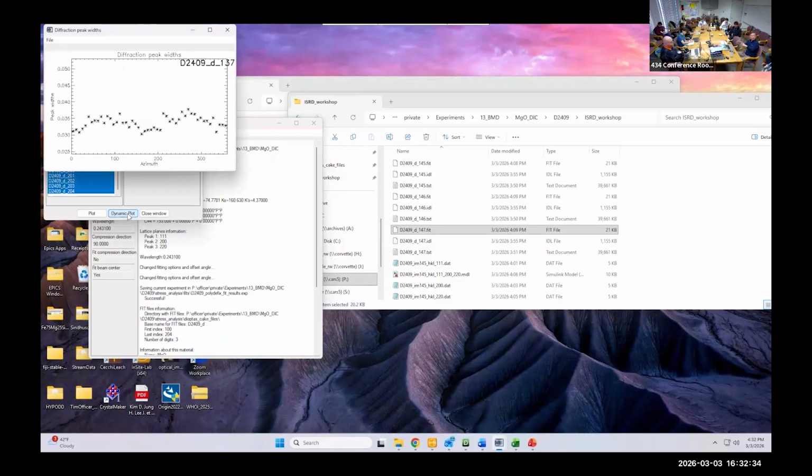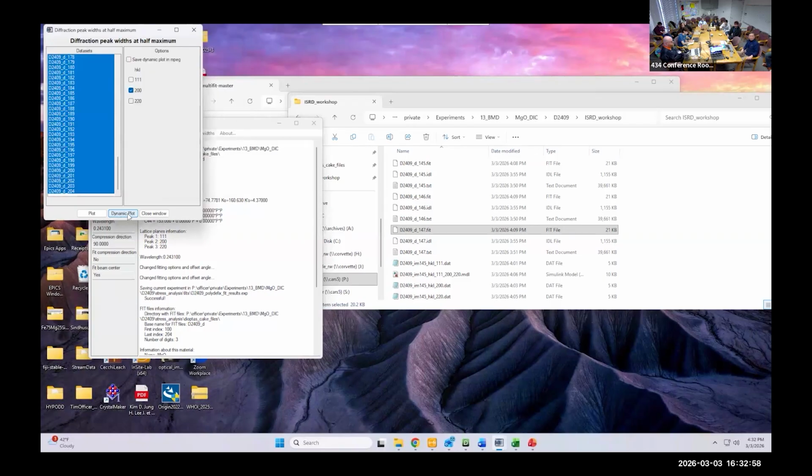Then you have heterogeneity. So the lattice dimension should be exactly the same, but the stress is not homogeneous from the outside. So there's a local variation, and then your peak will become broader. Or maybe another reason, you may actually produce point defects in the grains, which don't propagate very fast, especially at room temperature.